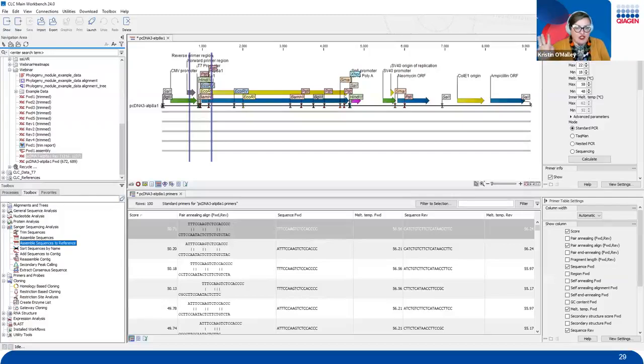So all of your NGS needs will be fulfilled through that genomics workbench. So again, all the stuff that we're seeing today is on the main workbench. And if you wanted to upgrade to that genomics workbench, all this stuff will also show up in that genomics workbench, as well as all the NGS stuff and metagenomic and all of that.